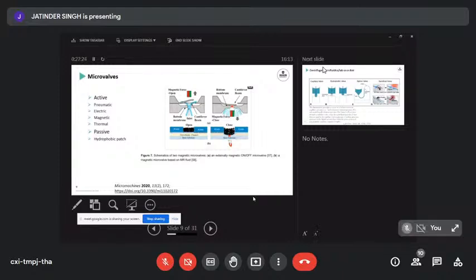So you stop the driving force of your liquid going through your channel, and you can stop your flow by having a hydrophobic patch, up to the point you overcome that pressure using an external pulse or by dissolving the hydrophobic patch, and then your liquid continues to move again.